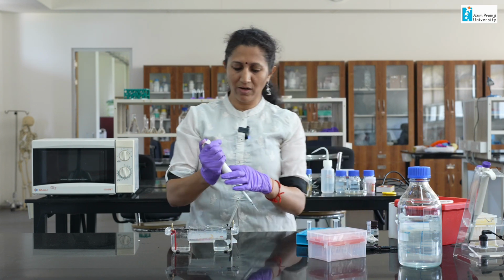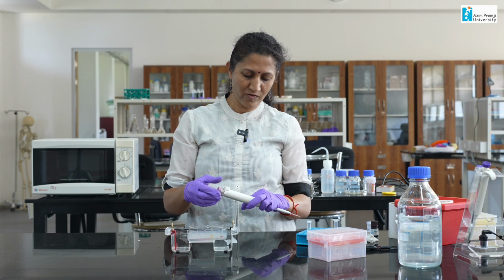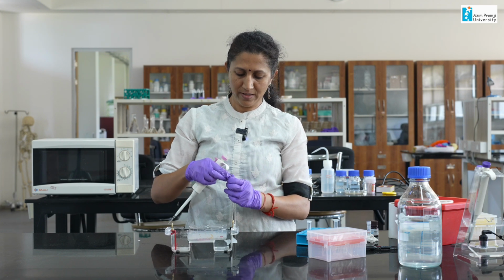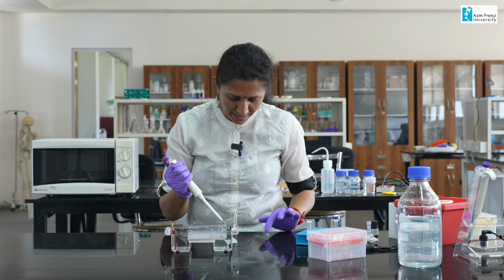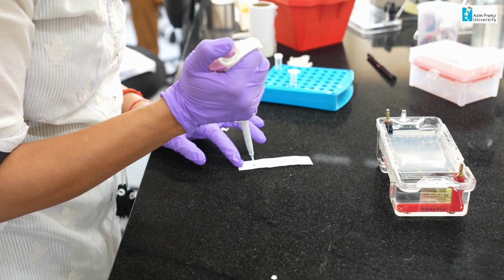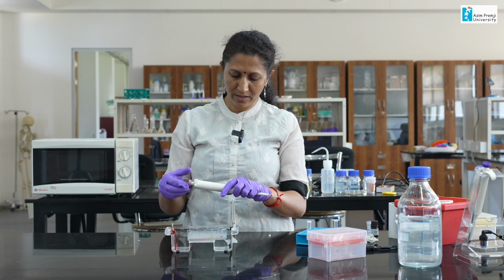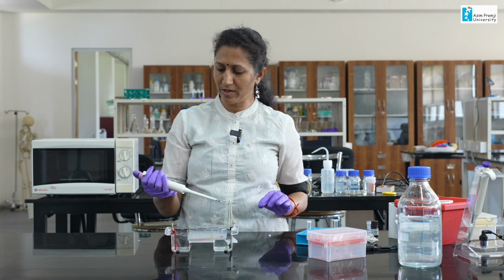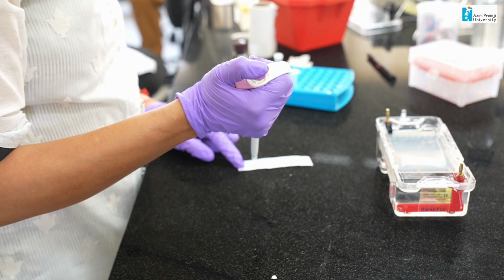Already I have taken 2 microliter of dye. So, I am going to add around 8 microliter of the amplified DNA sample into it. Remember that you have to store the DNA sample in ice, and then I am going to mix it. So, now I have to release the pipette and make it to 10 microliter, because I have taken 8 microliter of DNA and then 2 microliter of dye. The total volume is 10 microliter, and pipette back.